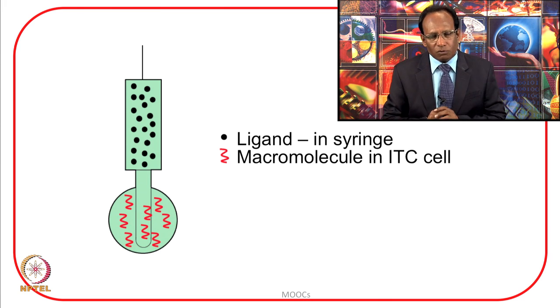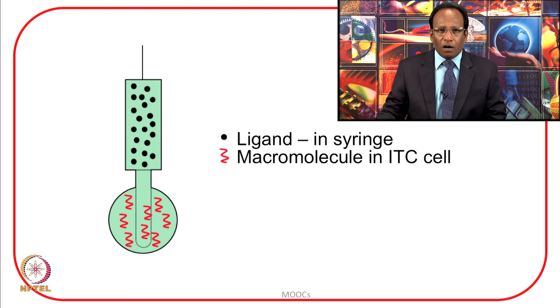What we want to study is how these molecules, when injected inside, will interact with the protein, bind to the protein and lead to changes in the heat signals.